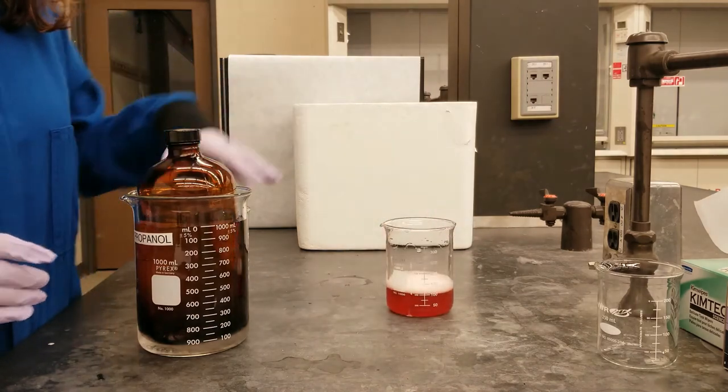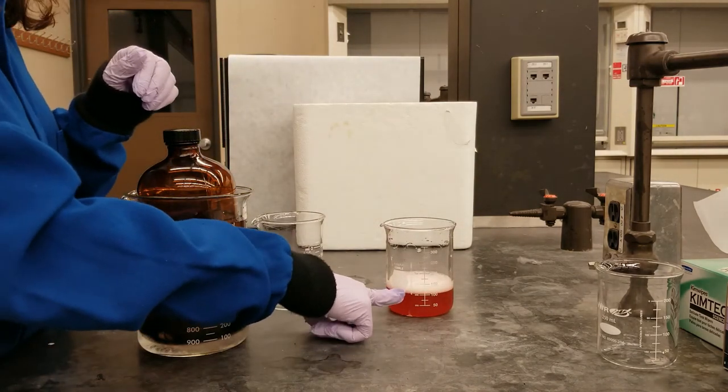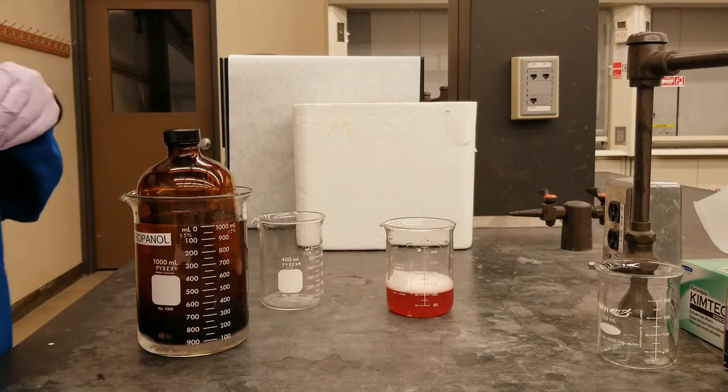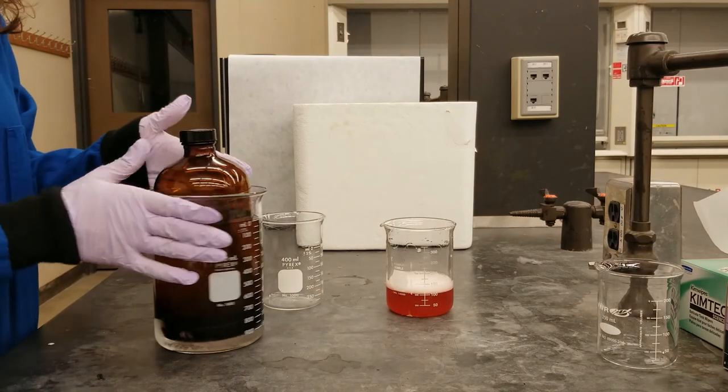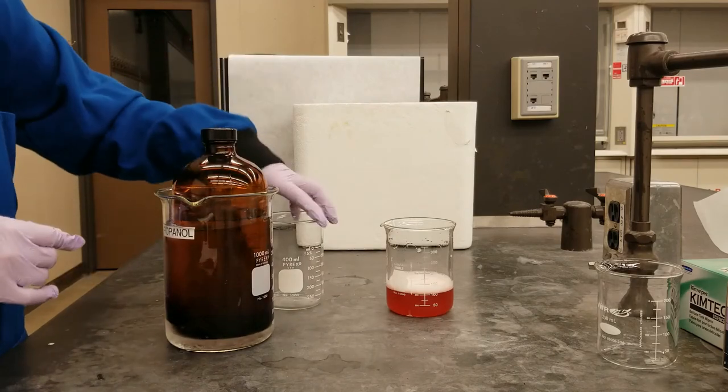Once we have our solution of our strawberry mix, we'll then estimate the amount of solution that we have in our beaker and measure out the same amount of isopropyl.